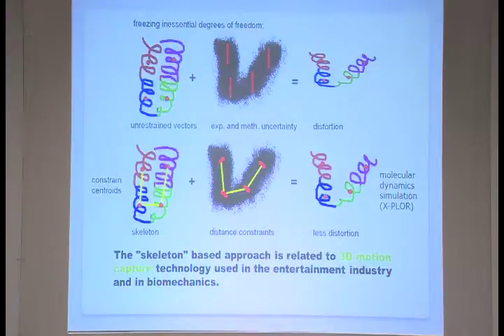It minimizes the difference between this vector and the map vector, finding the best fit. And then they incorporated this kind of skeletal motion, with a constraint on the vectors so that it moves and fits.